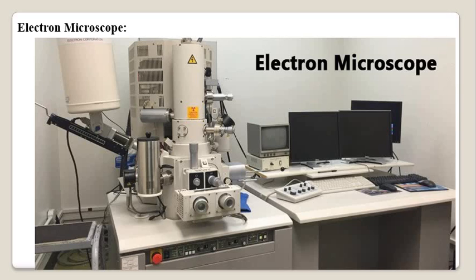Image formation occurs when the energy of the electron is transformed into visible light through the excitation of the chemical coating of the screen. Those electrons which reach the fluorescent screen form a bright spot, while the area where the electrons do not reach the screen forms a dark spot.